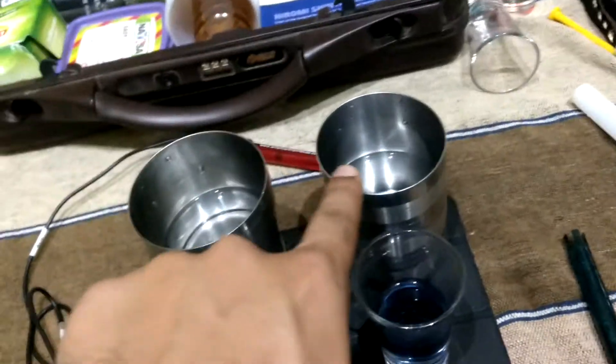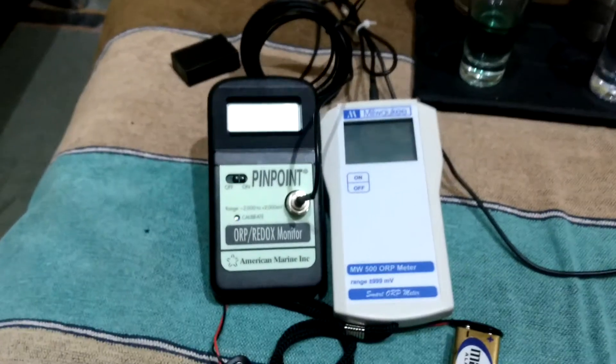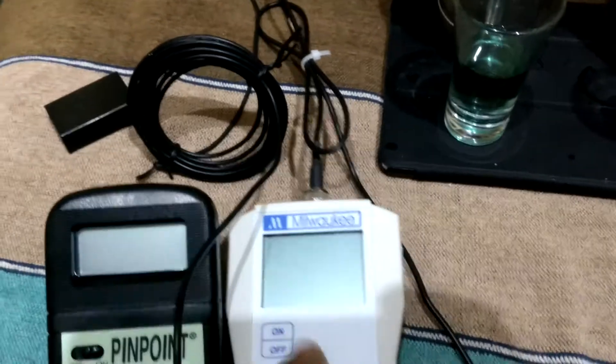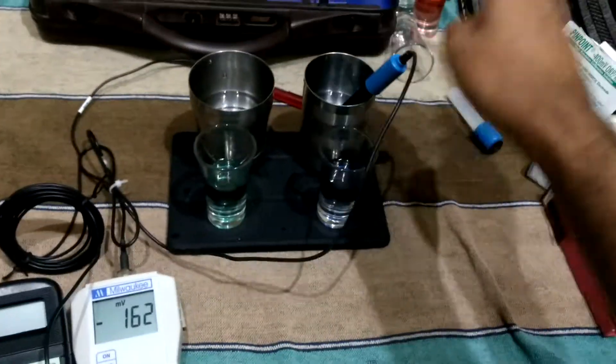I have two water samples: one tap water and one alkaline water. Both have very different ORP values - one is plus ORP and one is minus ORP. I have two ORP meters, one Pinpoint and one Milwaukee. Now I will check which one is faster, so first I will turn them on and put it in our glass.